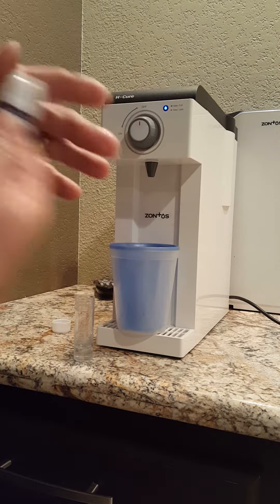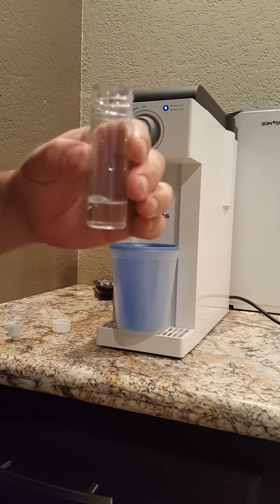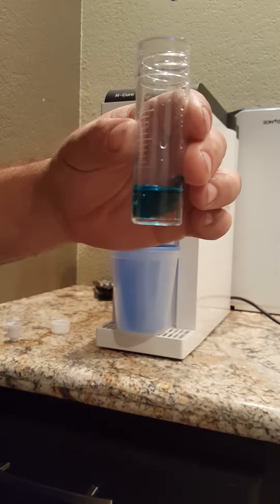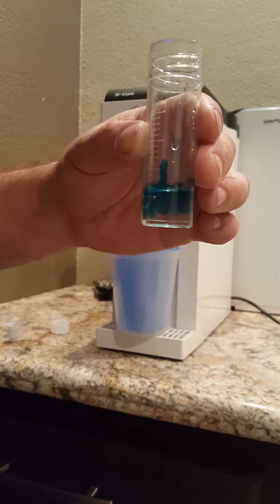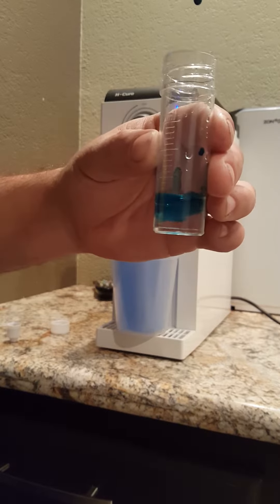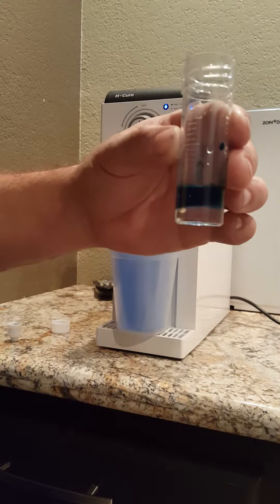So we're going to use the H2 Blue and each drop going in there will determine 0.1 ppm. 1, 2, 3, 4, 5, 6, 7, 8, 9, 10, 11, 12, 13, 14, 15, 16, 17, 18, 19, 20.